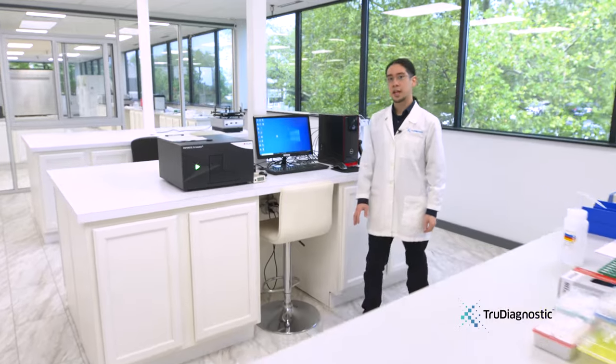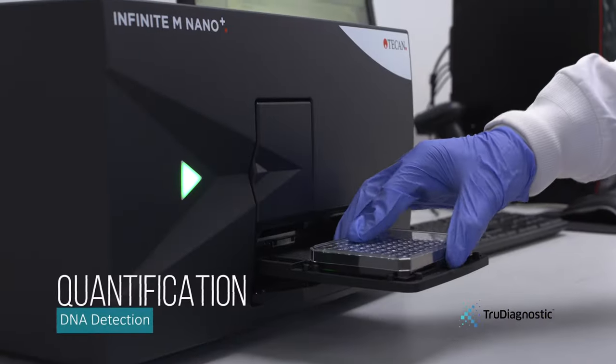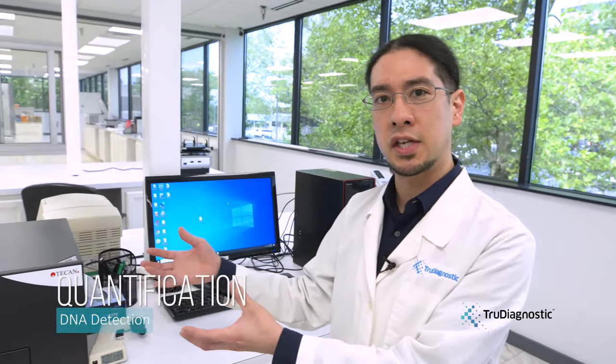In the DNA quantification step, we'll be using the TCAN Infinite Mnano. What this machine does is it reads fluorescence from the sample itself. How this works is that we take the DNA sample and bind it with a fluorescent marker and put it into this machine.